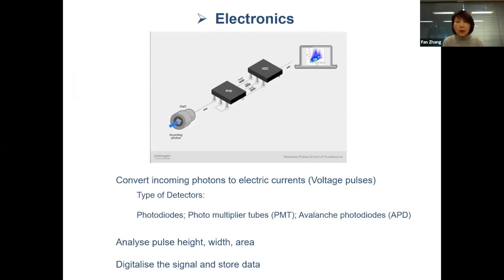The electronics are used to convert light signal into data. So the electronic detectors convert incoming photons to voltage pulses. These pulses are then converted to a digital number by an analog-to-digital converter. The digitized number is then transferred to a computer and stored as data for us to analyze.